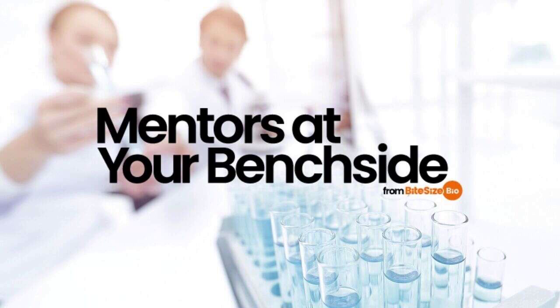Number 1, problematic inserts. You prep two plasmids simultaneously using the exact same protocol and had different yields. If the plasmids have the same backbone, that is, they are both pUC or pBluescript, etc., then the reason leans towards the insert playing a role. Some inserts can be problematic for bacteria. It might be that a protein is made that makes the bacteria sick, for example DNase. Or it could be that the insert is unstable, for example repetitive sequences.